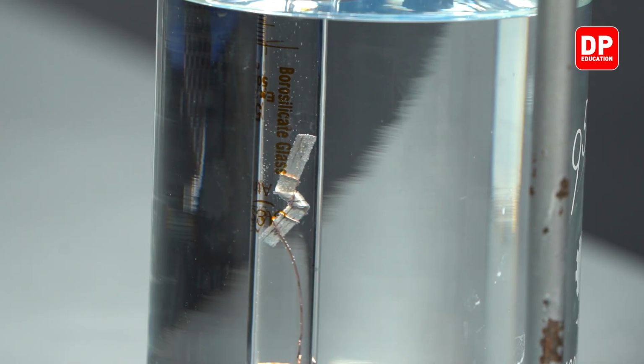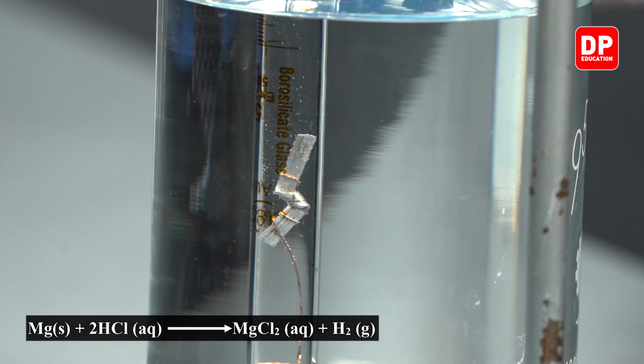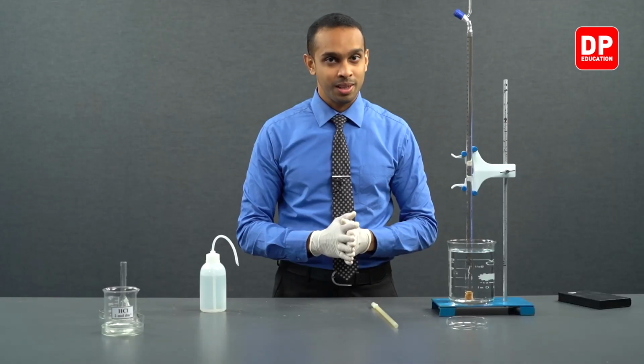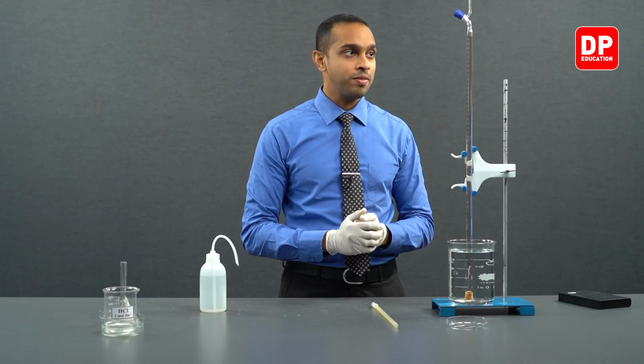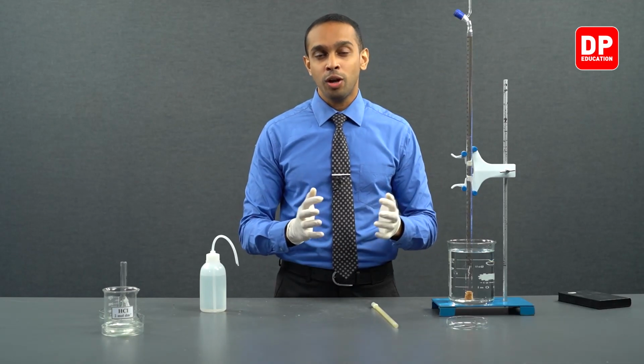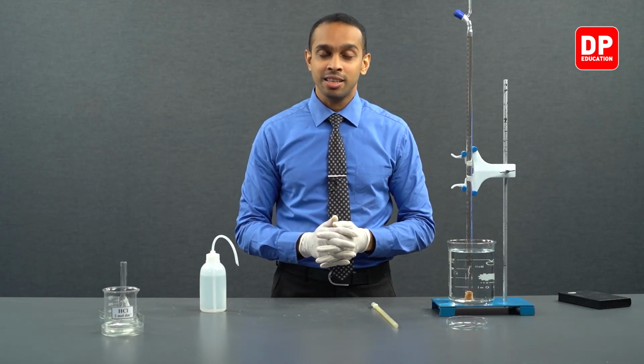So if you allow it to stand for a while, you will see hydrogen gas being produced due to magnesium reacting with HCl. Let's wait for a while and allow the hydrogen gas to collect in the burette and take the volume reading of the hydrogen gas that is produced.